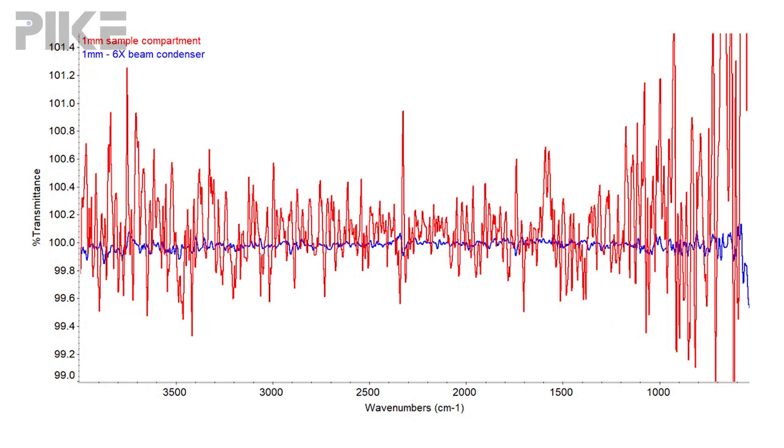The detector was a DTGS detector. I collected 32 scans at eight wavenumber resolution. The red spectrum was simply putting that one millimeter aperture sample in the beam path in the sample compartment holder.